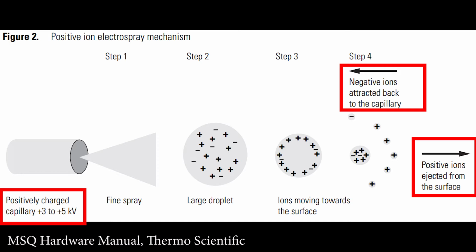And it turns out they're not pushing it directly into the mass analyzer. They are in fact pushing them into ion optics that are ahead of the mass analyzer. They're going to act as an intermediate pumping region to decrease the vacuum and also guide the ions into a nice beam so we don't lose a bunch of them.